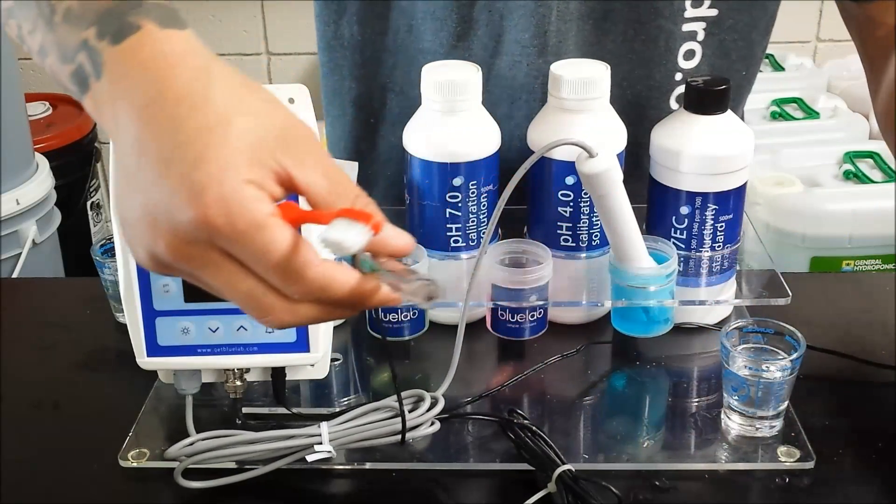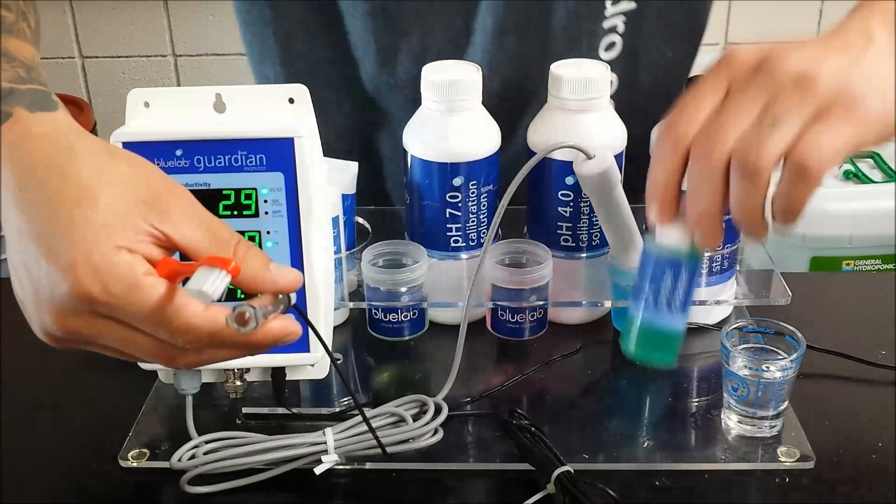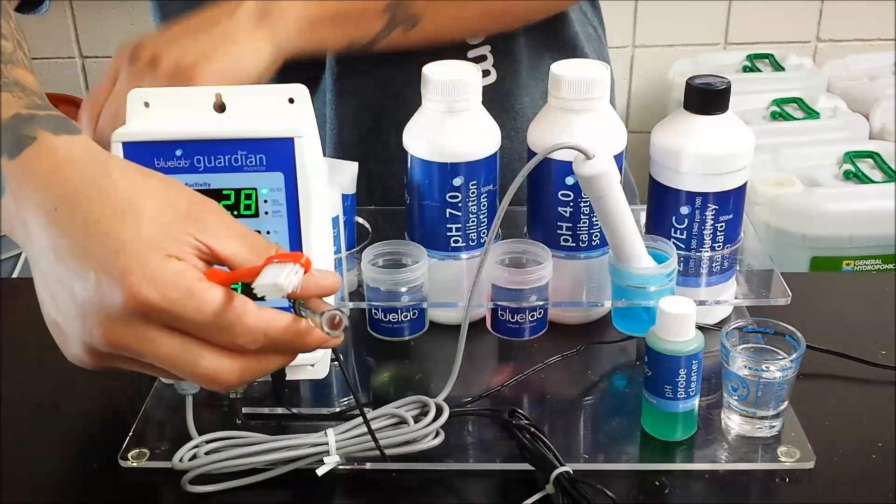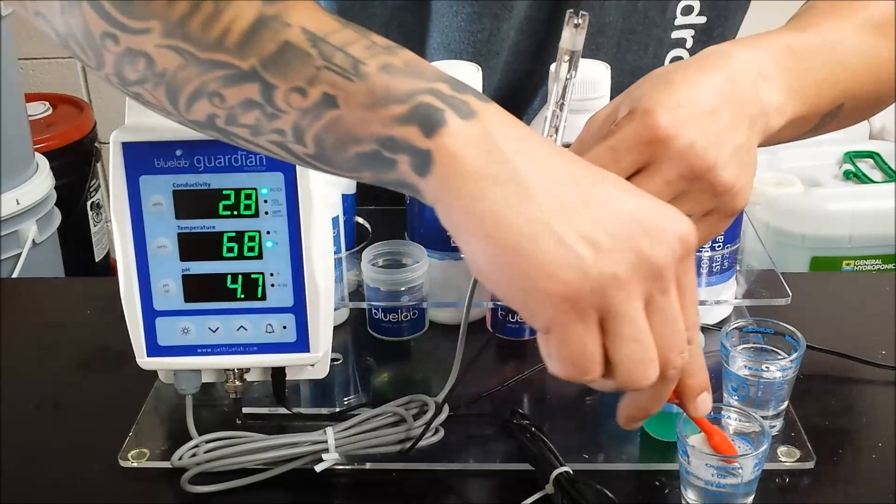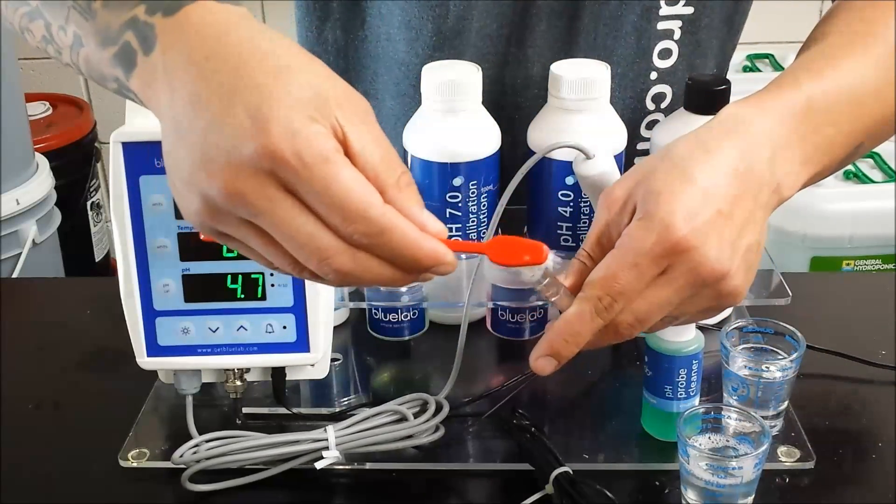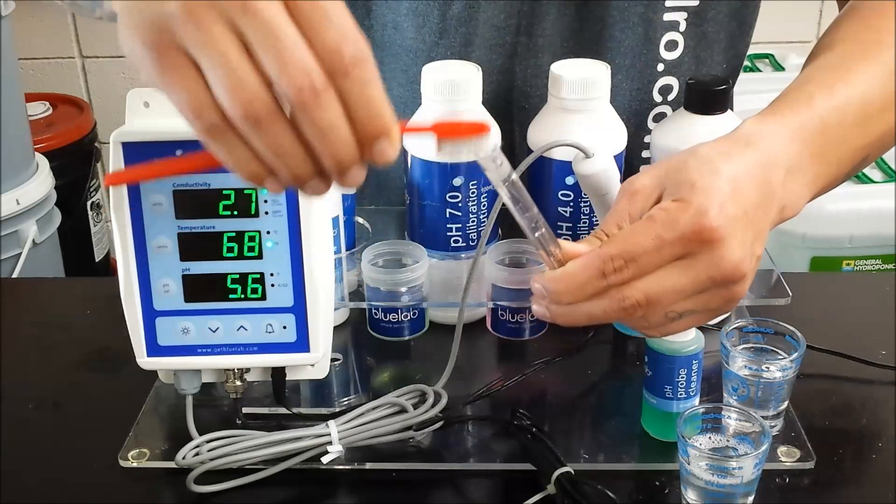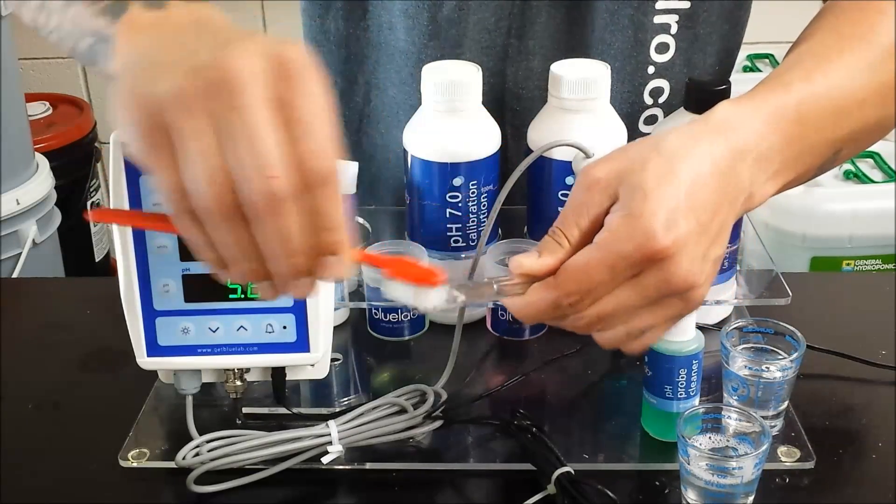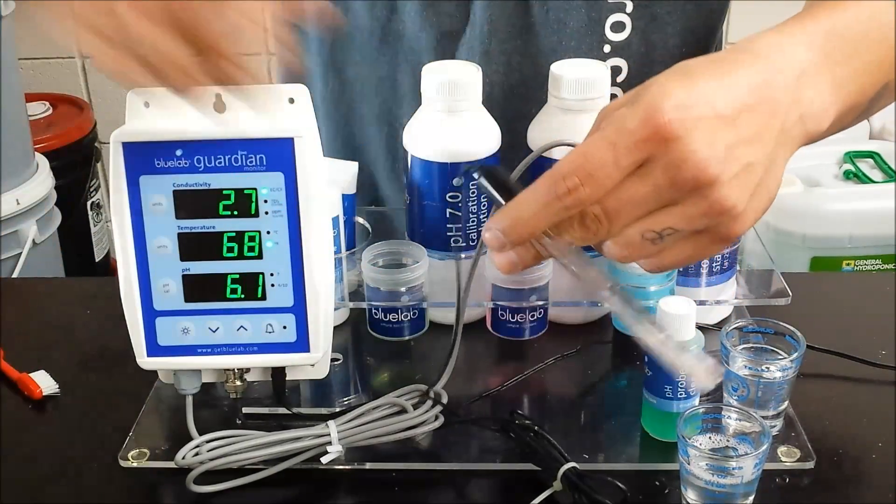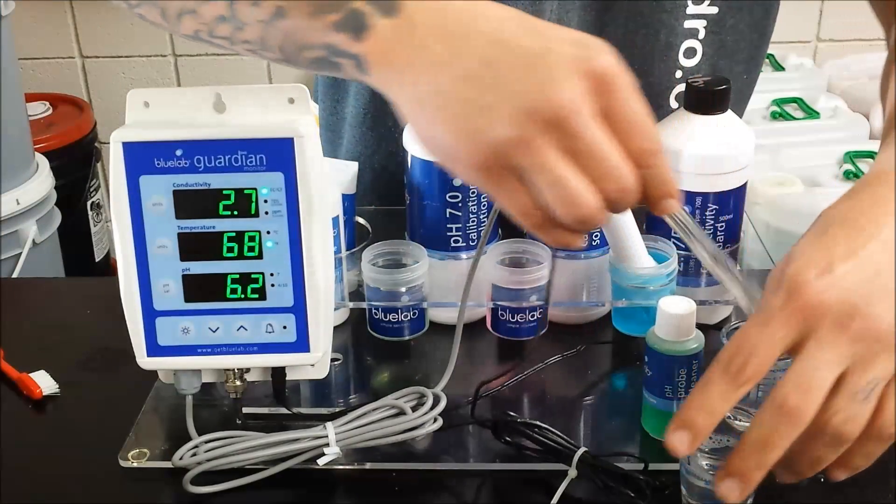And cleaning our pH probe here we have the Bluelab pH probe cleaner, again mixed with some water. Toothbrush. Go ahead and twist it around, scrub in there. You want to be nice and clean. Rinse in some water.